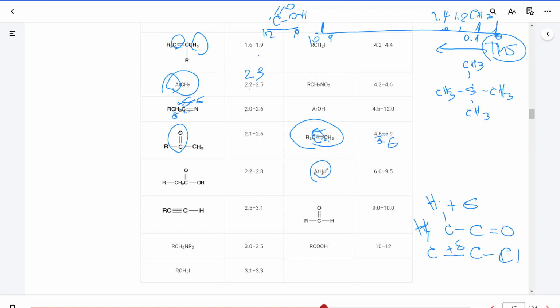Aromatic hydrogens, this is very significant for any identification. The first thing you want to look at is the signals between 7 and 8. If there is no signal, your compound is not aromatic. But if there is a signal between 7 and 8, your compound is going to be aromatic. Now, an electron withdrawing group is going to increase that number. Conjugation would lower that number. That's why we have a broader range here. But 7 and 8 is a safe place to look. If there is a signal here, your compound is aromatic. If there is a signal between 5 and 6, your compound is an alkene.